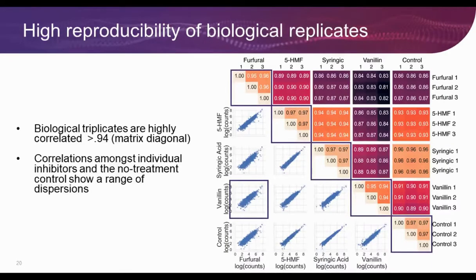We first map the barcode sequencing data back to the genomic edits that we designed, as you see here in this table. In each row, we have the independent promoter or knockout, and in the columns, we have the biological replicates and count data from some of the treatment conditions. This gave us in total more than 800,000 data points.